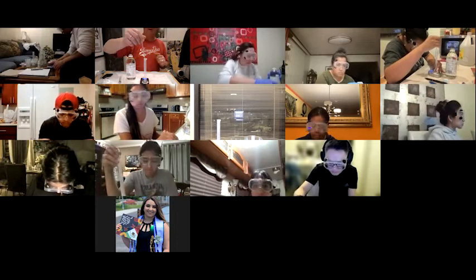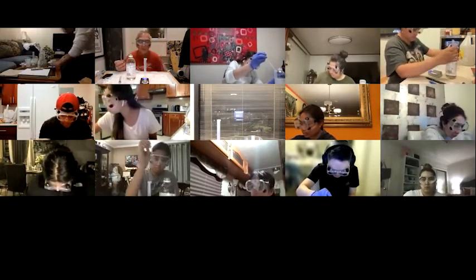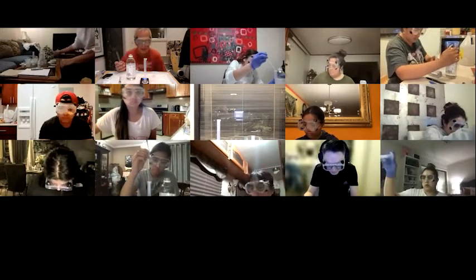If you go a little bit over, that's no problem. What's most important is you get an accurate mass. I've gone a little bit over, but it doesn't really matter. 5.79 grams. Then I'm going to use the density to convert that to an accurate volume.